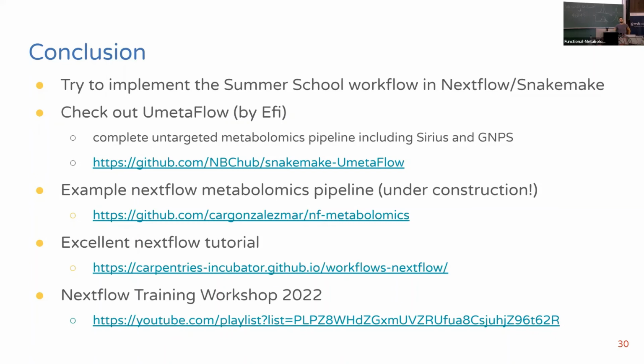I would try and check if that works, but usually if you have an LC setup and MS setup that does not change, I guess it should be kind of safe to use the same parameters for your machine. But of course, it depends on the individual experiment. What's your experience? Do you use the same pipeline for different experiments, or do you change it all the time? I don't change it much.